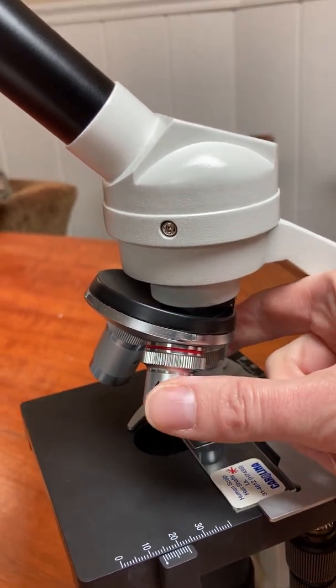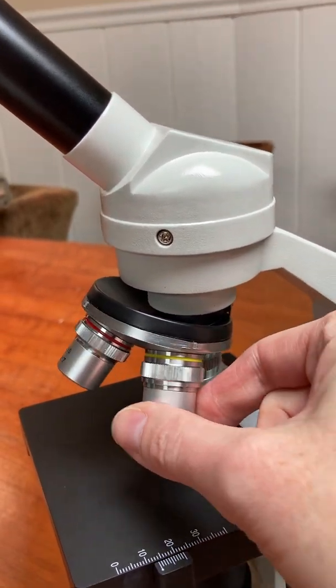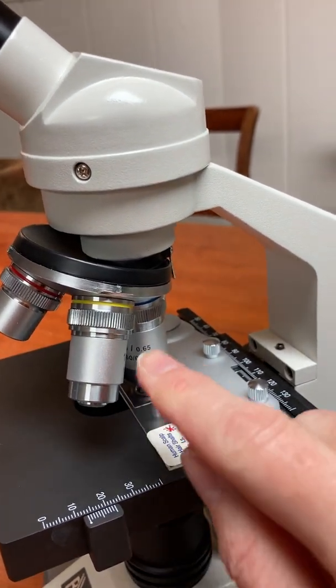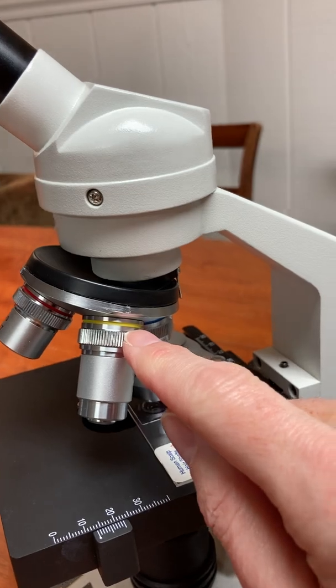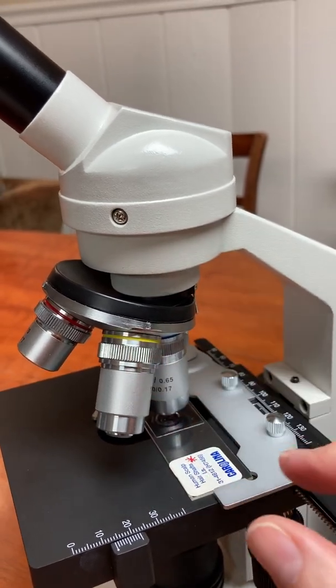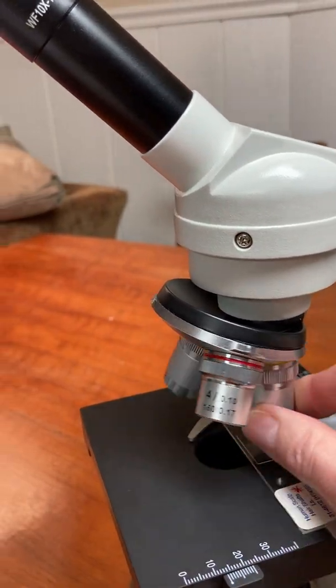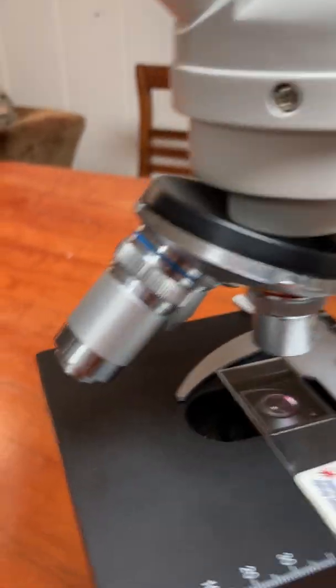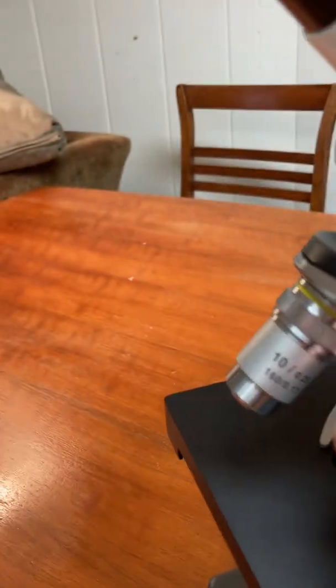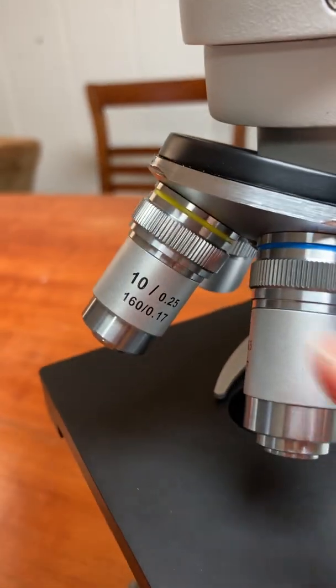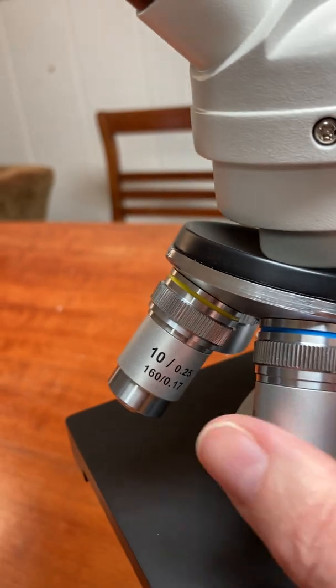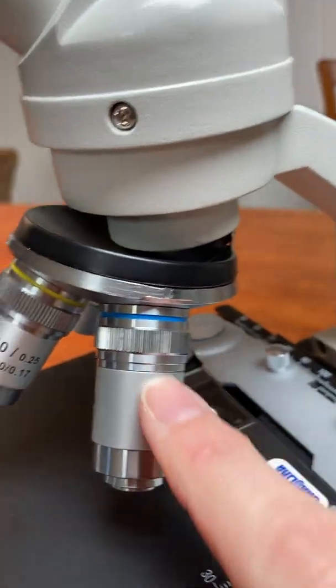And now I'm going to move the nose piece so that the middle power objective is facing us and see how it has a yellow ribbon around the top. This is low power. And if you look on the other side, there it is. It has a number 10 on it and that is the power of that objective.